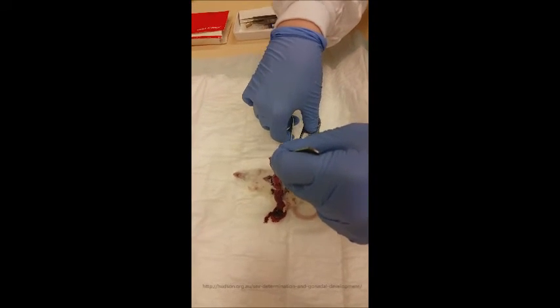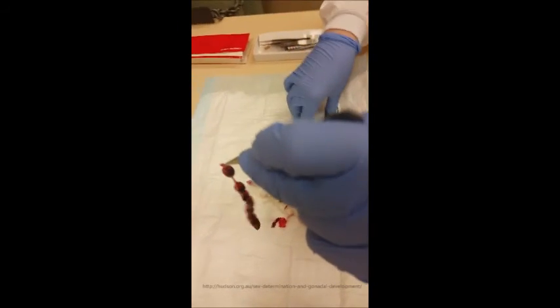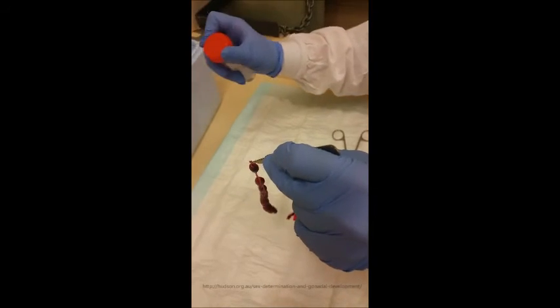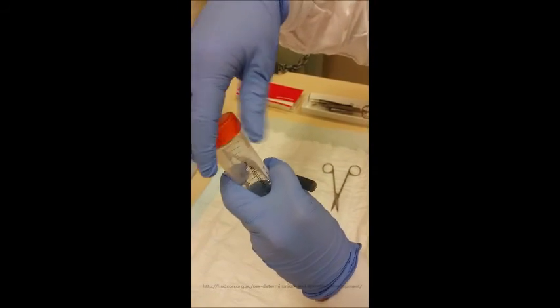You just need to cut away there, and what you'll end up with is a big long string of embryos. Then you just put them into ice-cold PBS, which will anaesthetize them.